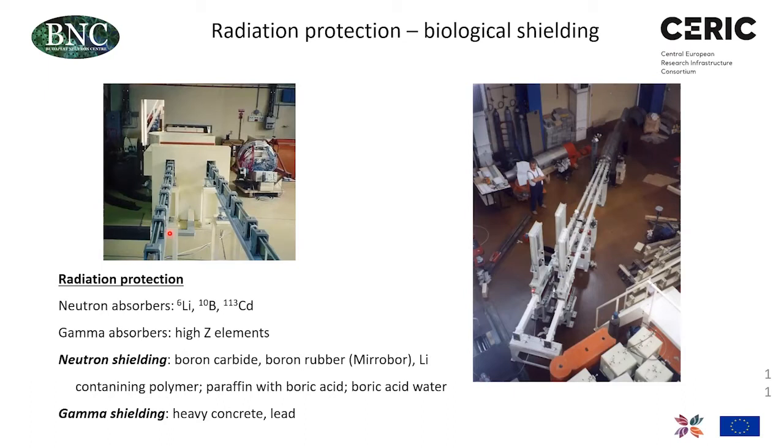If a wave approaches an interface of air and condensed matter at a low angle, it is reflected rather than absorbed. And with a series of reflections, we can deliver the neutrons far away from their production site, but at the same time, we can reduce the unwanted high energy components of the neutron beam, and we can also get rid of the gamma radiation. So this is a very essential part of the measurement system.